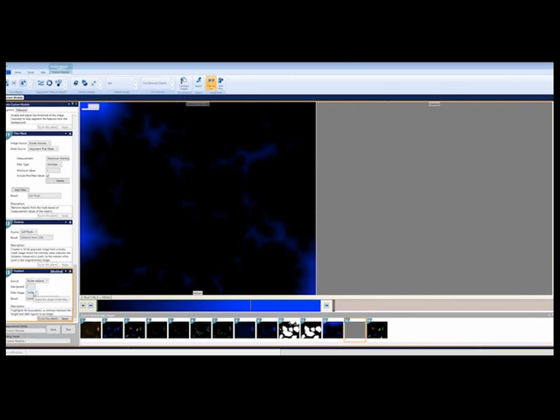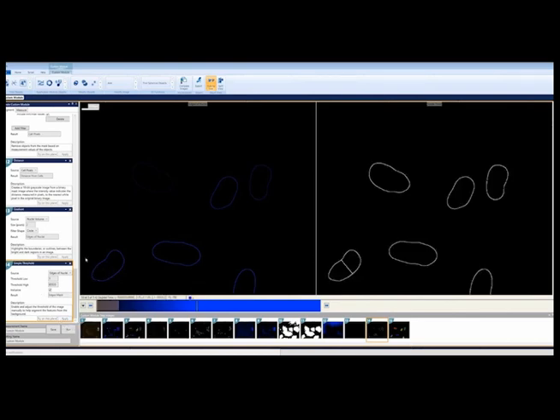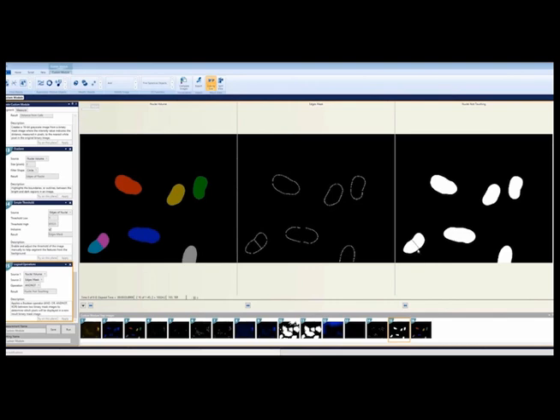Then, to generate the nuclei markers, we will add 3 steps. The nuclei volume mask has the objects we need, but isn't binary, and the nuclei which are next to each other don't have an empty pixel between them. So we will trace the edges of the nuclei and cut those edges out of the volume mask, and in the process turn the nuclei volume into binary markers.